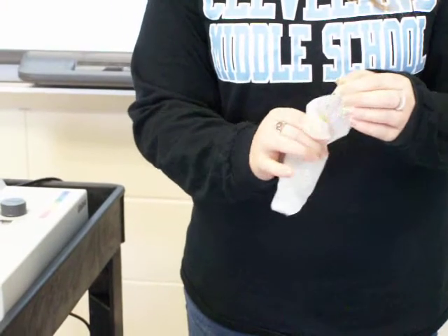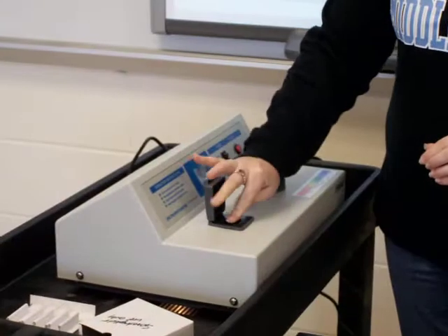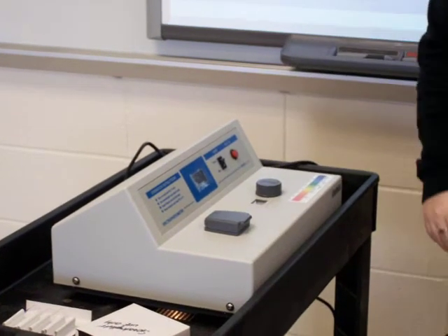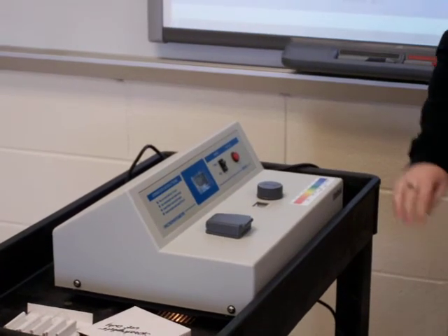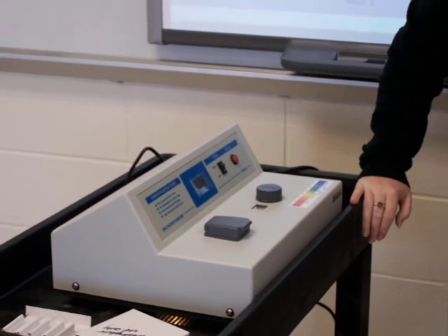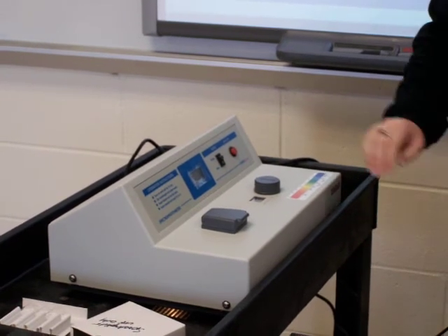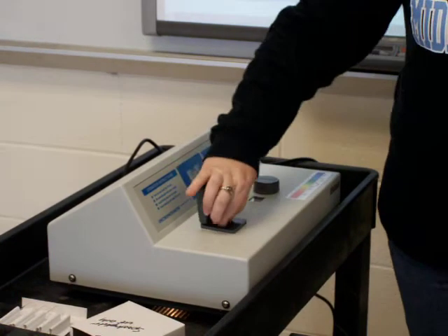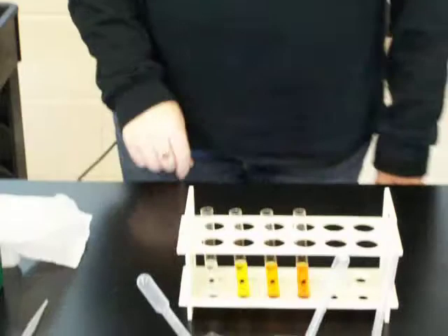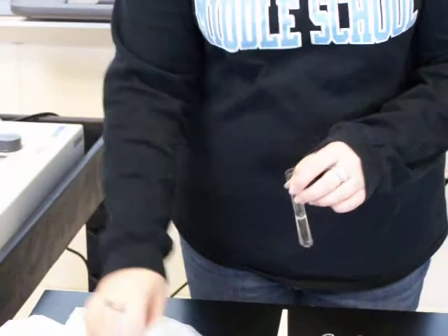I'm going to wash off any fingerprints. Put it in the spectrophotometer. So it has an absorbance of 0.07. She's now going to use the blank again between each of the samples.